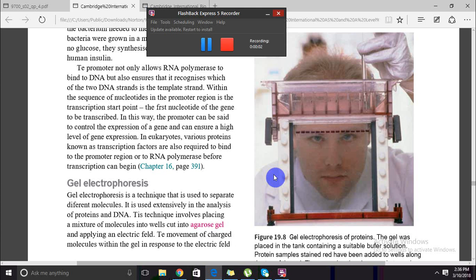Hey guys, welcome to part 2 of the video on genetic technology, and in this video we will talk about gel electrophoresis. This is mentioned in the syllabus that we need to know how to analyze proteins and nucleic acids via this technique, and also how to distinguish between alleles of the same gene using gel electrophoresis. So you really need to get an understanding of the principles behind this process.